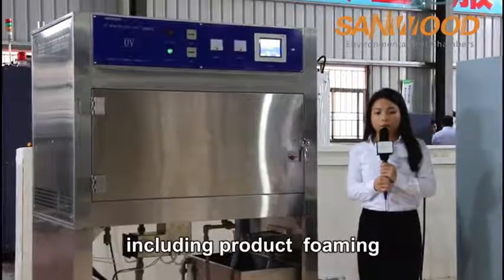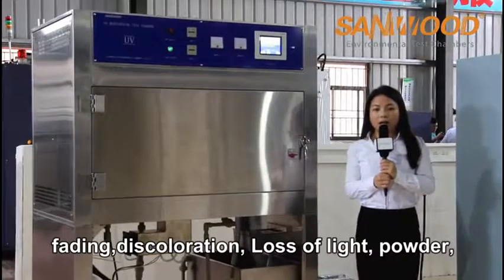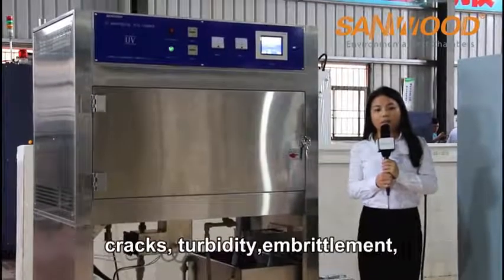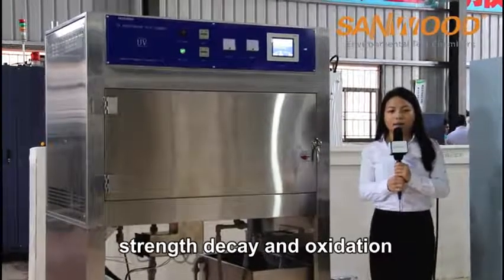The damage types it simulates include product foaming, fading, discoloration, loss of light, powdering, cracks, turbidity, embrittlement, strength decay, and oxidation.